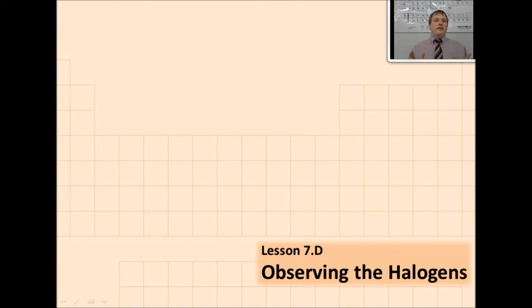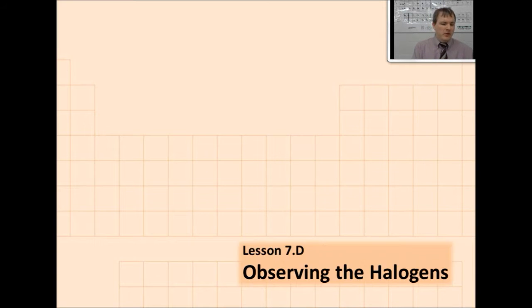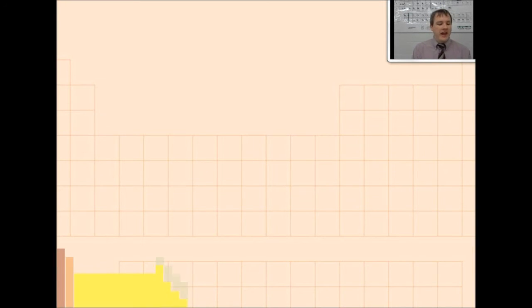halogens. You're going to observe, first of all, the atomic structure of the halogens, and then a real-world demo involving creating halogen gases and then observing their reactivity. Now we're going to begin like we always do by looking at where the halogens are on the periodic table. The halogens are the group that's the second from the right, way over in the nonmetal side of the periodic table. All of the halogens, the entire group, is composed of elements of nonmetals.